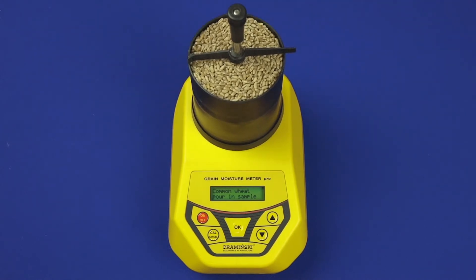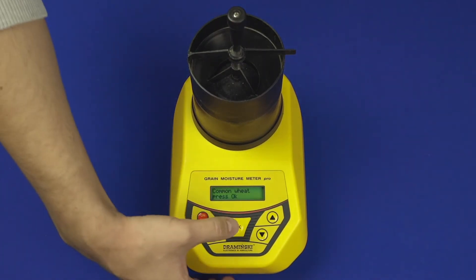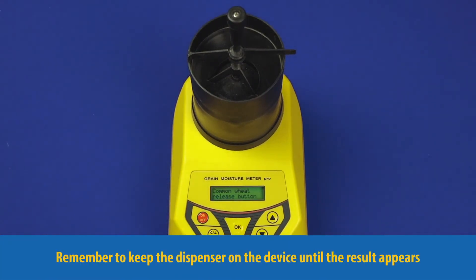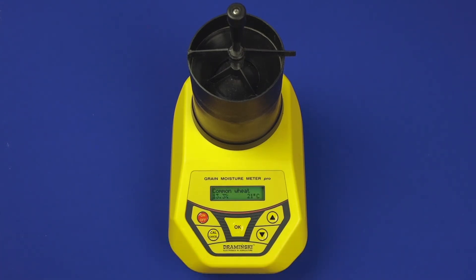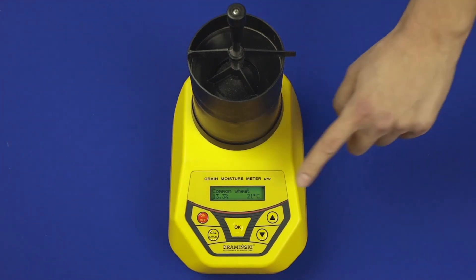Release the grain into the measurement chamber and press the OK button. The device is going to test and analyze the sample, displaying its moisture content and temperature.